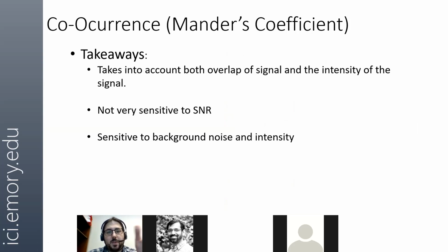For reference, a summary. Manders coefficient is not very sensitive to SNR, but it is very sensitive to background noise and noise in terms of the pixel intensity.